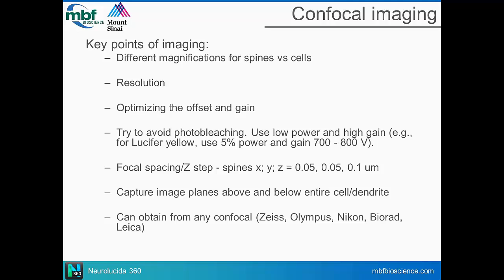I don't think it's as good as a confocal, but I've never had that much experience with it. You may have to fiddle with the system to see exactly what resolution you can get. But I think it would take much longer to obtain the image versus a conventional confocal.